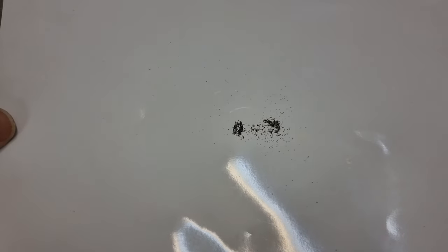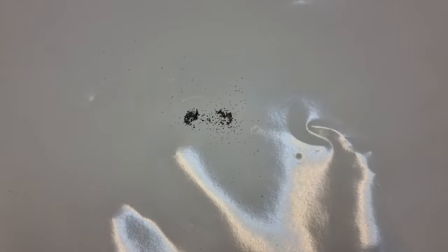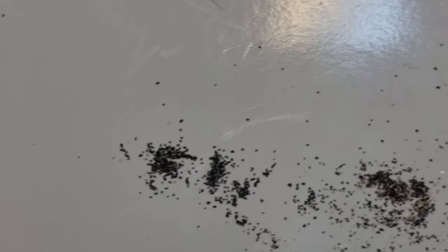Now, I think if you go and look at the studies of this sand, you will note that a proportion of it is iron rich. Interesting to see. Can anyone see if that's... Some of that is going around, away from the magnet. Let me zoom into this a bit closer. See. It is only a proportion of the material. It's a good proportion of it, but it's only a proportion of it.